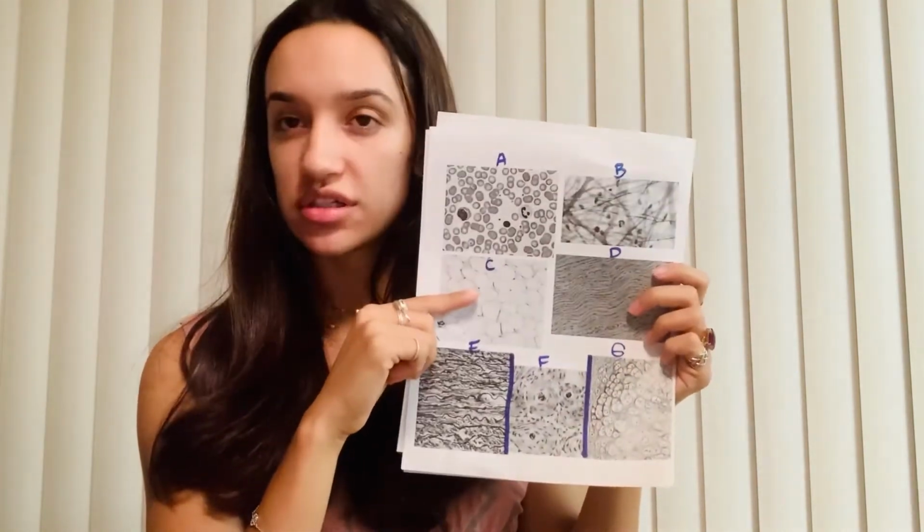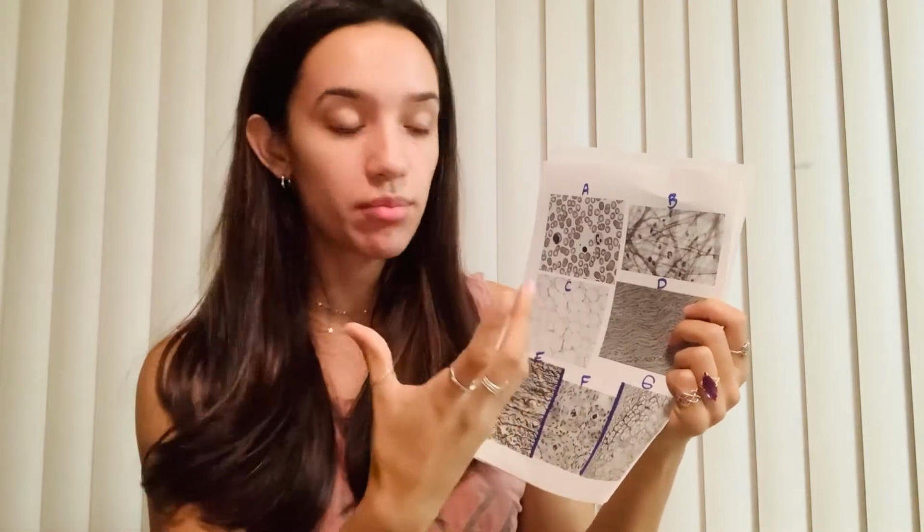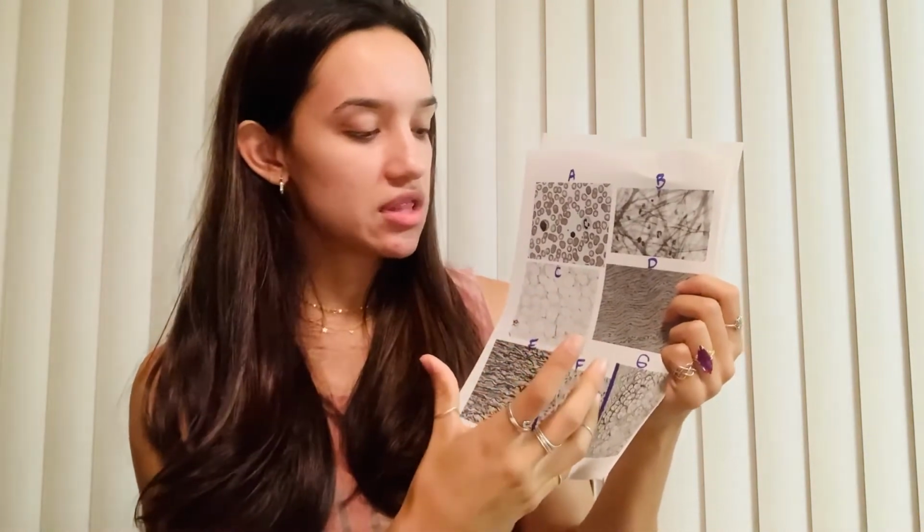So as we can see here, connective tissues each have matrices, which are non-living solutions, and overall they have many different functions, but I would say that a main function of theirs is to connect different structures of the body. We also see that their function is storing.